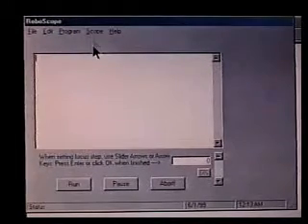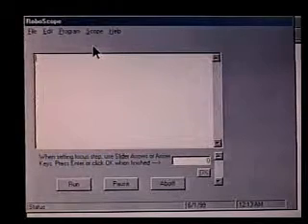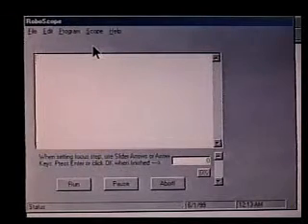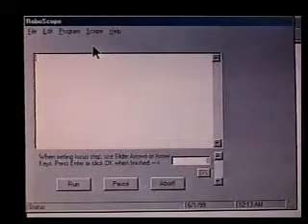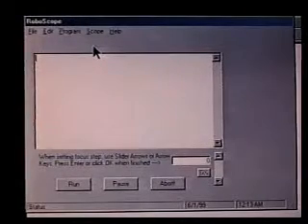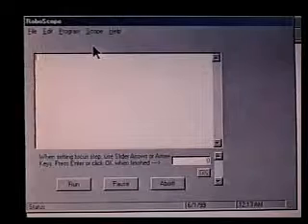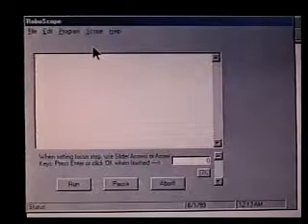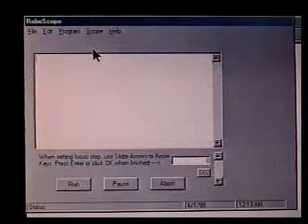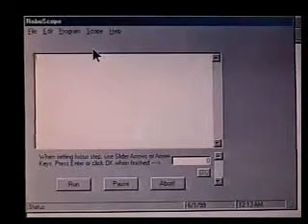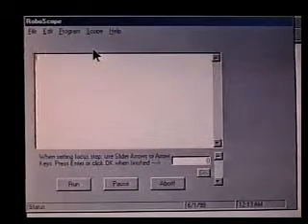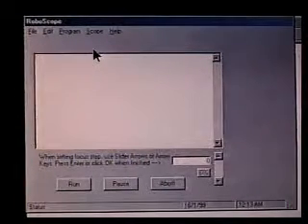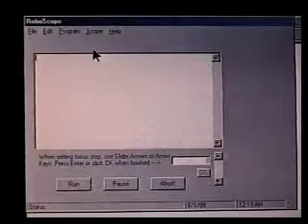So, we're going to write a program which is going to acquire data in four sequences. We have a sample of pond water, which has some fluorescent algae and other animals in it, and we're going to acquire images both with fluorescent light, white light, and also in two different focal planes. So, in essence, we're going to be making four time-lapse movies simultaneously from the same data sample.